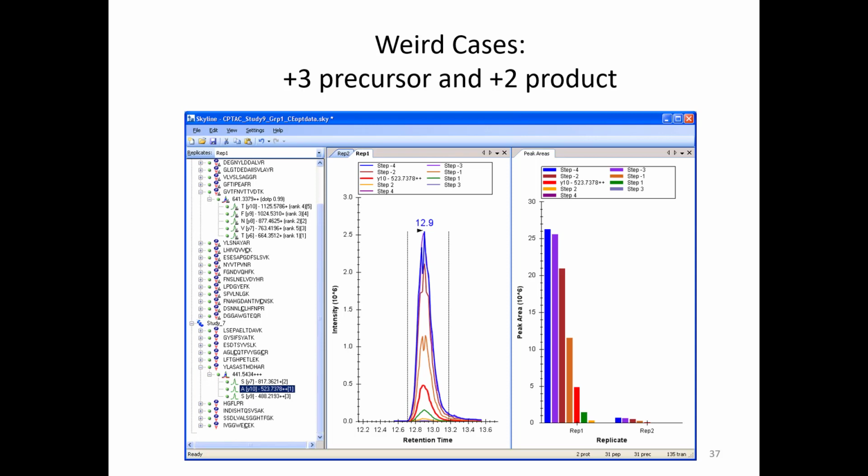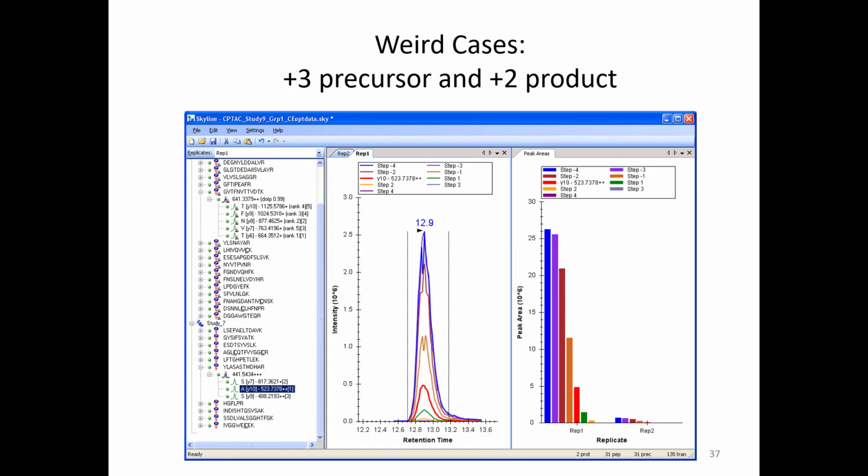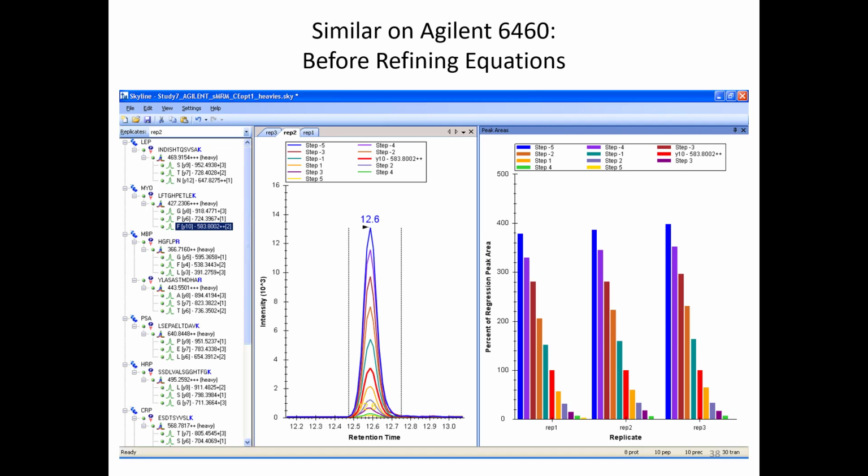And it's like, no one's gotten around to doing it, but if anyone wants to come up with a cool paper and give it to Brendan, then the numbers would be right in there and it would be awesome, just saying. And it's not just on one type of instrument either, it's on multiple instruments. So we came across this in the CPTAC study.